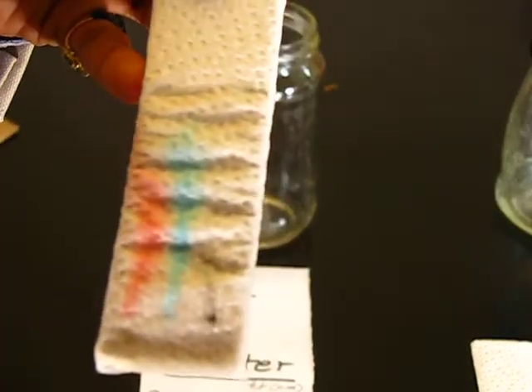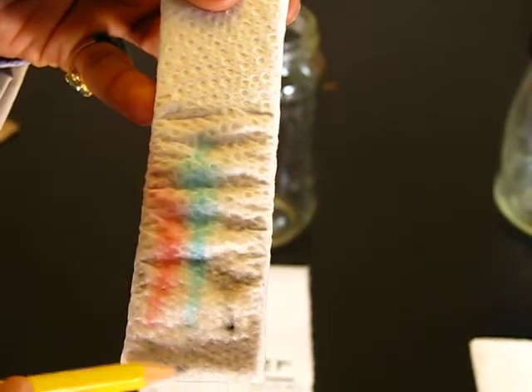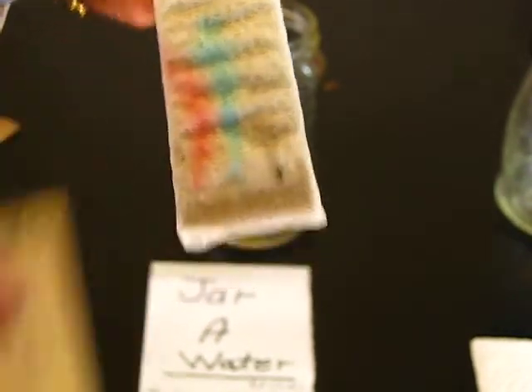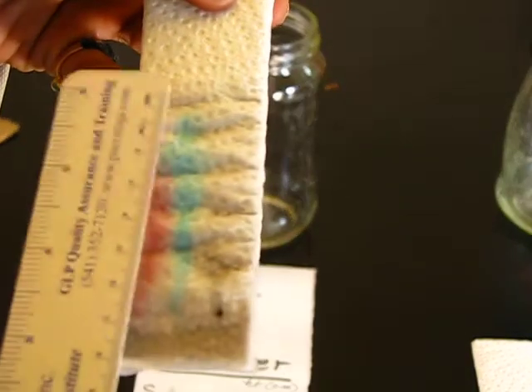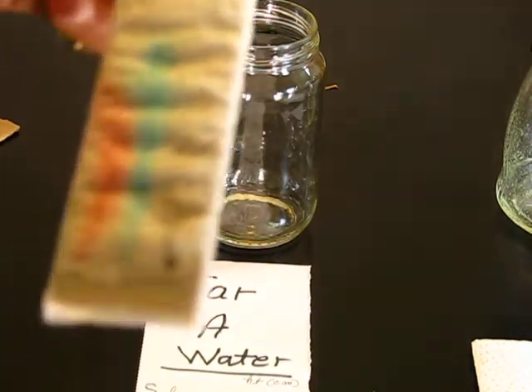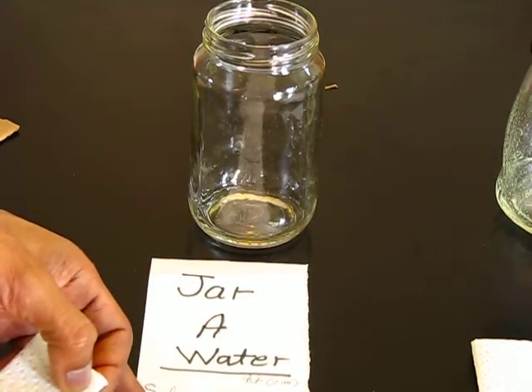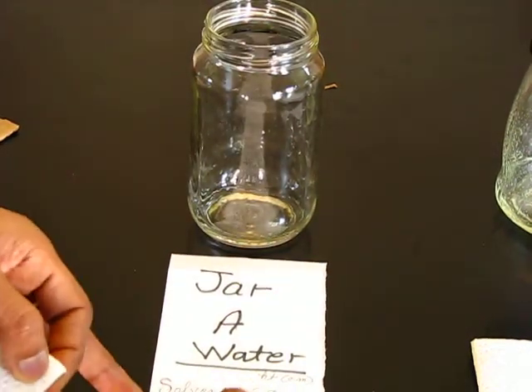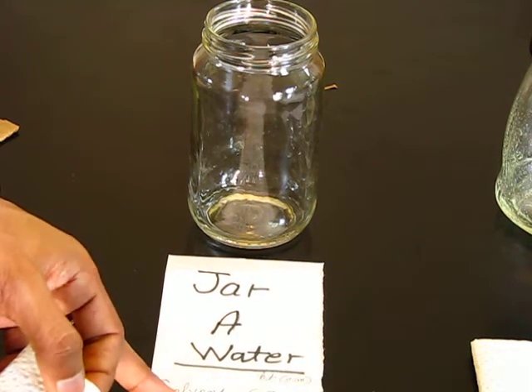I remove the TLC from the jar and note the heights. The solvent front — water — moved around 6.5 centimeters. Blue color height is around 6 centimeters. Red is around 4.5 centimeters. Black color is hardly moving — only about 1 centimeter.